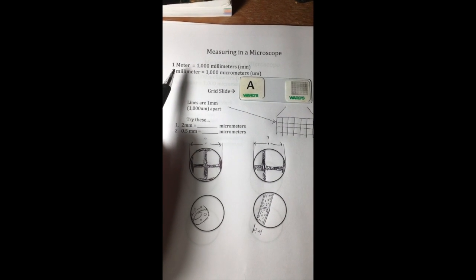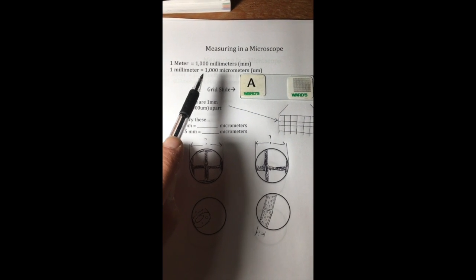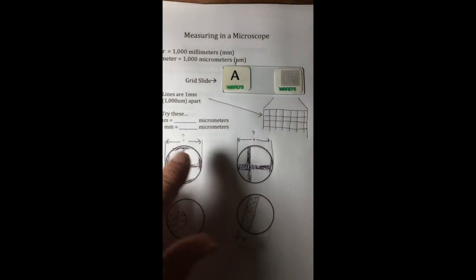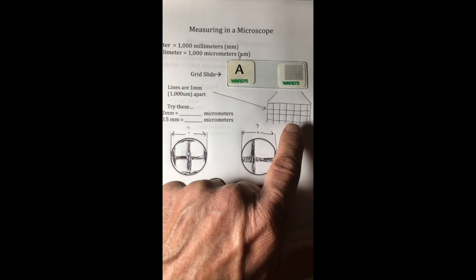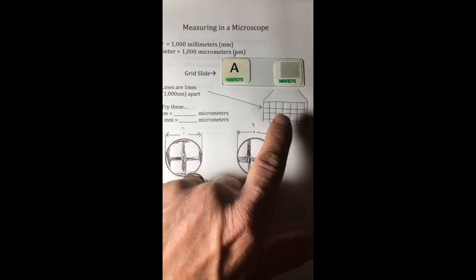So before we start, you need to know that a meter can be divided into 1,000 millimeters, and a millimeter can be divided into 1,000 micrometers. Oops, that needs a tail. That's a micrometer. This is a grid slide, and we're going to be putting a grid slide in the microscope. And if you look at a grid slide closely, you'll see that there are lines. These lines are 1 millimeter apart or 1,000 micrometers apart.